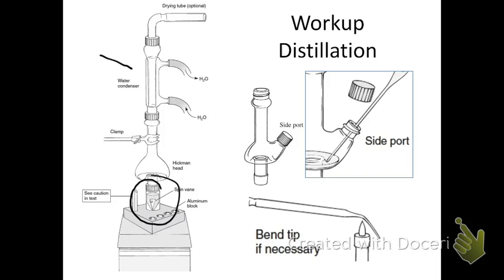The water condenser is used simply to capture vapors and to prevent some of your product from going out the top in case you overheat it or in case it bumps. By the way, this liquid does have a tendency to bump. When you do the distillation, hot gases will rise up from the conical vial and cool in this space.